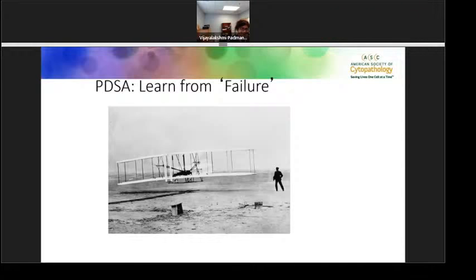There's a couple of questions from the audience. One of them is asking specifically, do you process small biopsies as cytology specimens? And this is an important thing. The follow-up is that small biopsies for molecular testing are becoming a big issue. How do you treat small biopsies in your system?